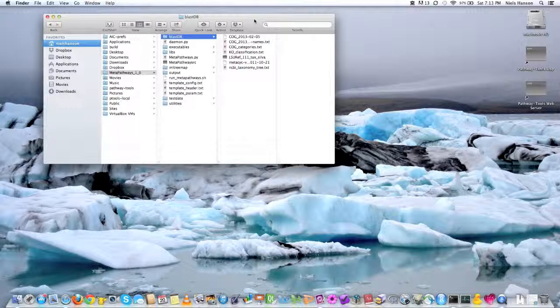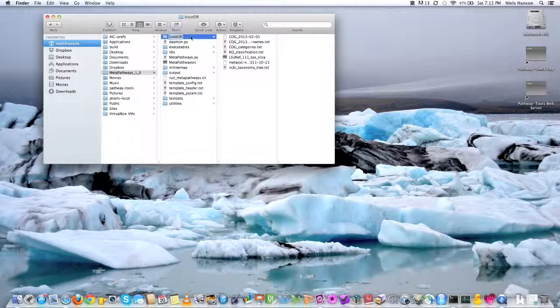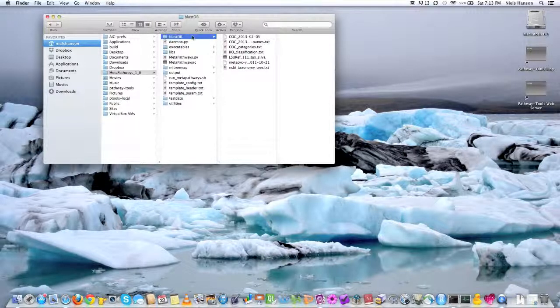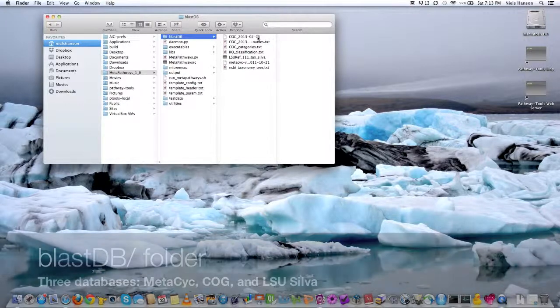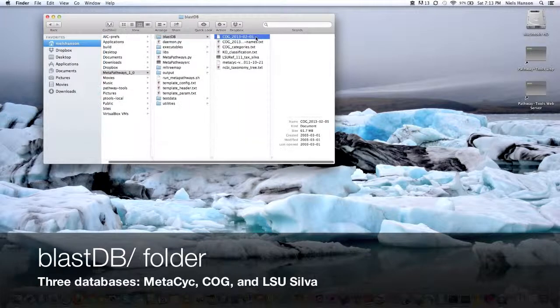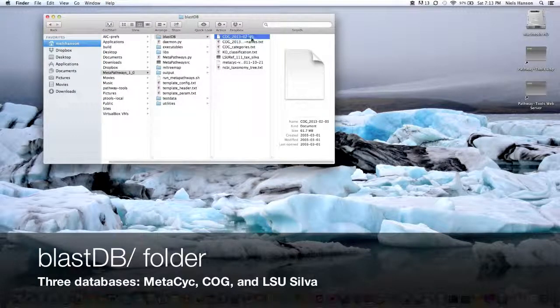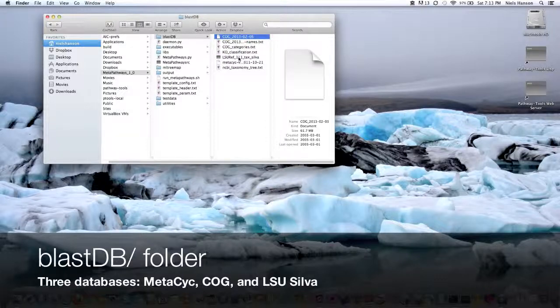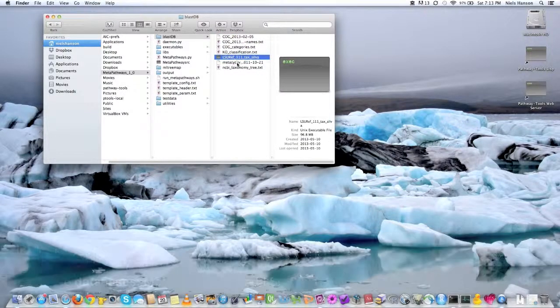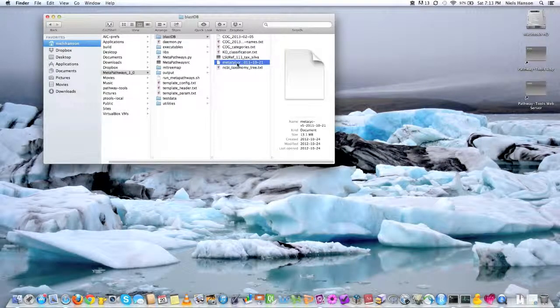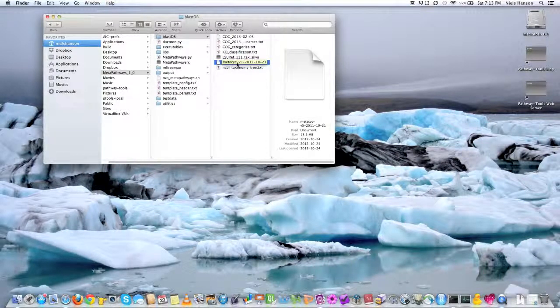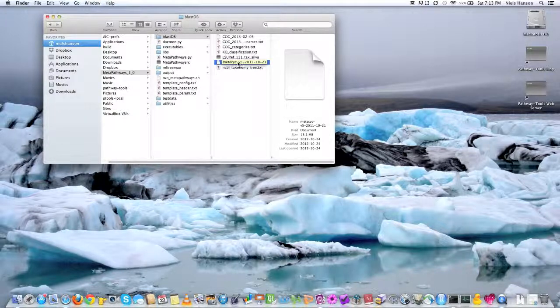And so we're going to focus our attention to this BLASTDB folder, which is in the MetaPathways directory, and in here we actually only have three databases that are distributed. We have the COG database, clusters of orthologous genes, and we have the Silva large ribosomal subunit database, and MetaCyc, which is a subset of the Uniprot database that correspond to enzymes in pathway tools.